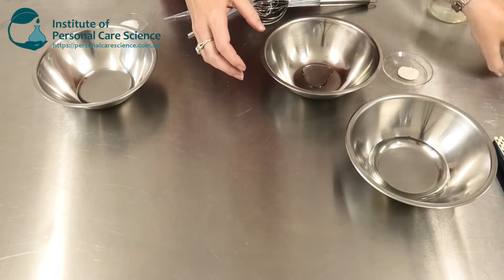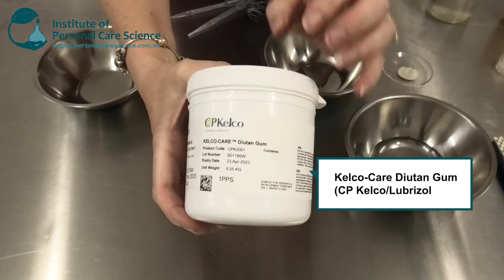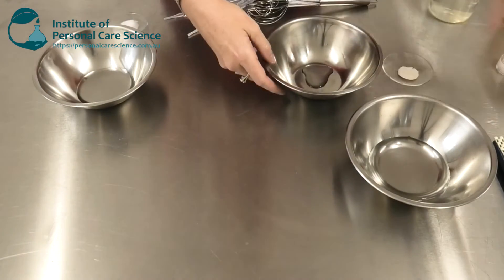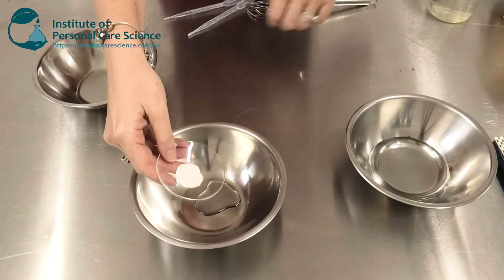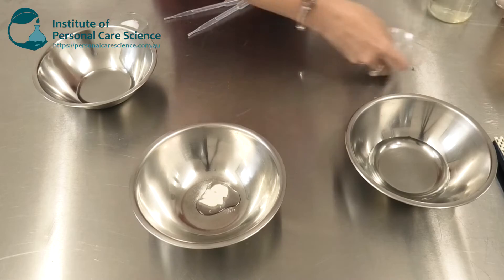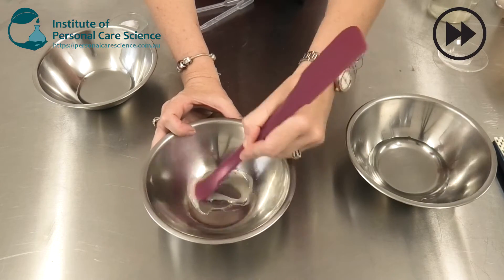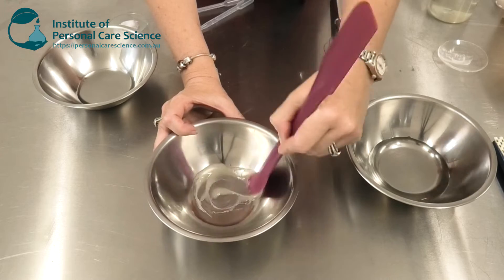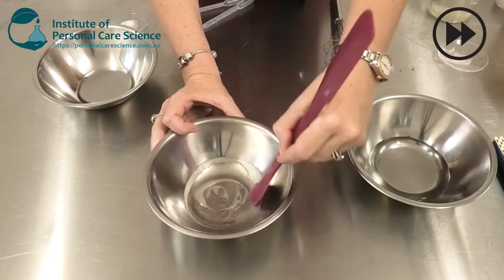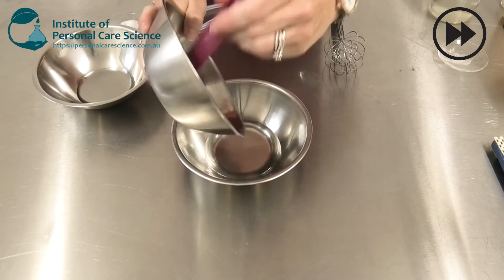I am stabilizing this product using diutin gum, which is a material that's really stable in the presence of a lot of acids. The first thing I'm going to do is just mix that gum with some glycerin to make a slurry so that it's super easy to add to the water phase. Then I can add it to my water phase and make a gel.